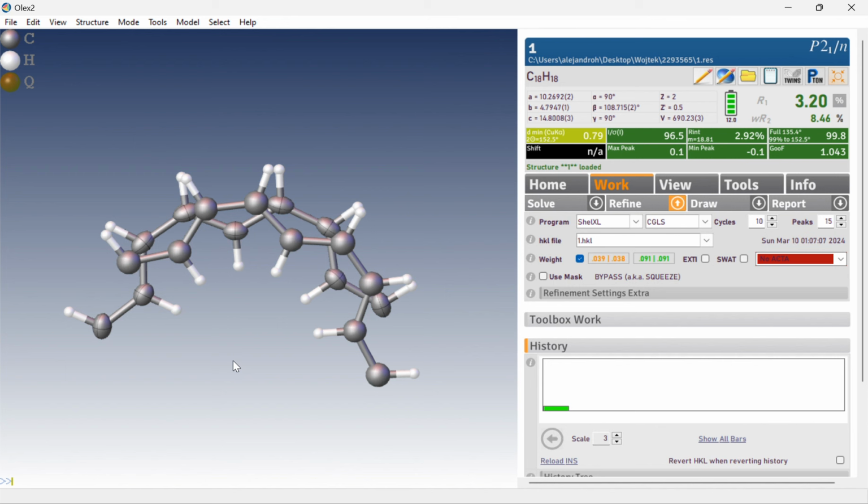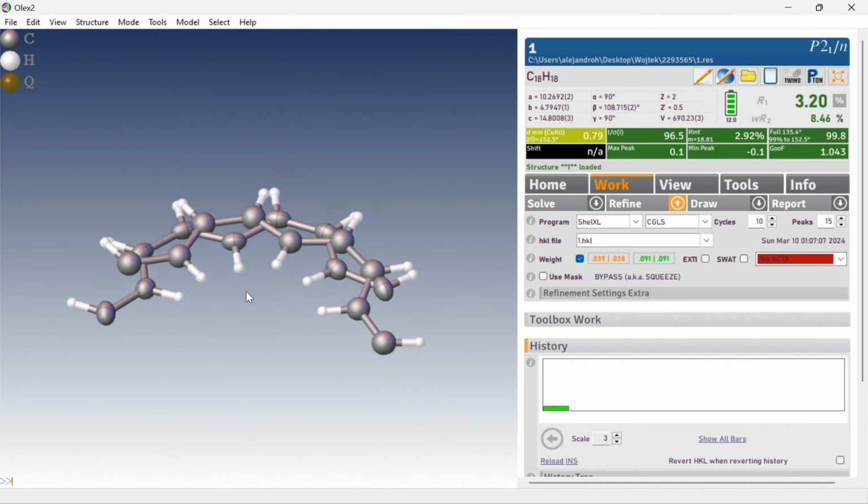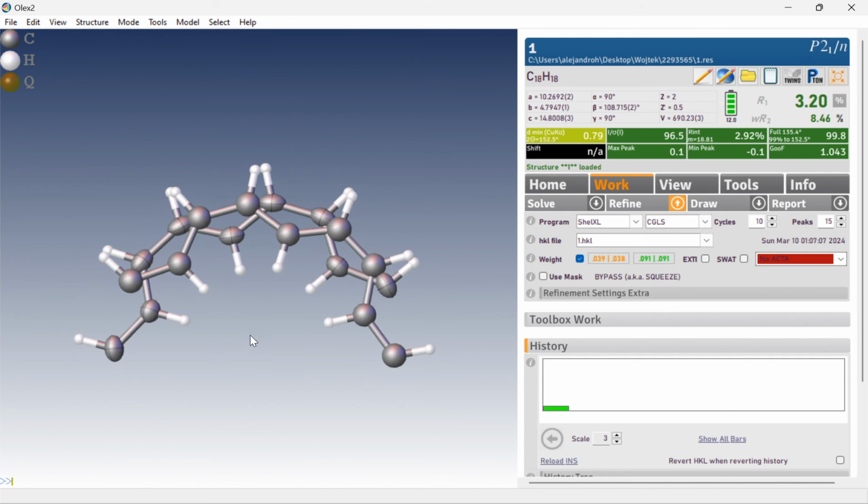You can experiment with this dataset. It's a very nice dataset to experiment with and learn some new stuff. Possibly if you increase the strength of the same distance restraints, the bonds from part 1 and part 2 will become more similar to each other.